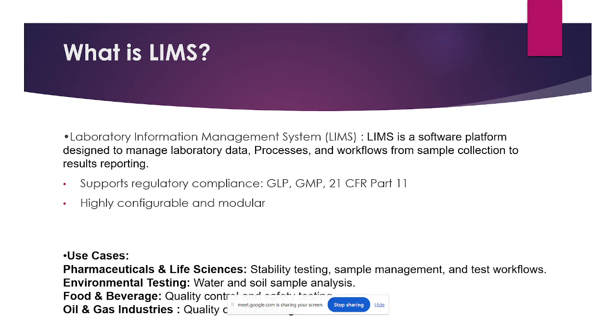Majorly, LIMS supports regulatory compliance. It will support 100% compliance, like GLP, GMP, and 21 CFR Part 11. I think in 2019, 21 CFR Part 11 was updated.